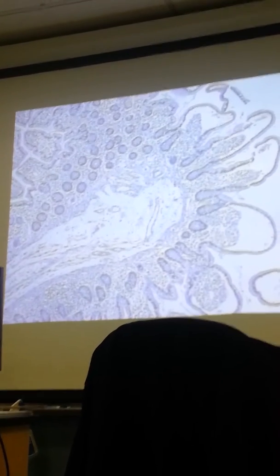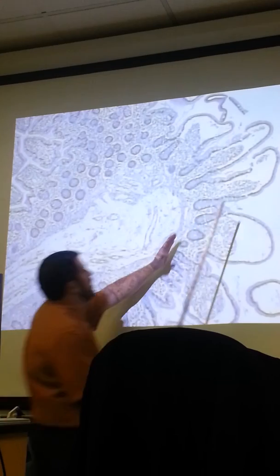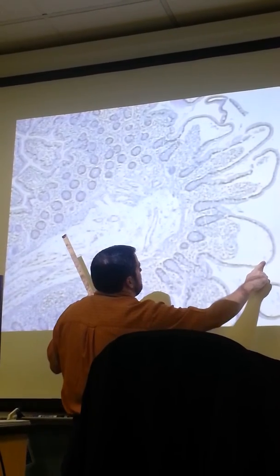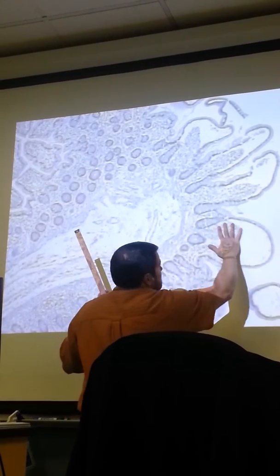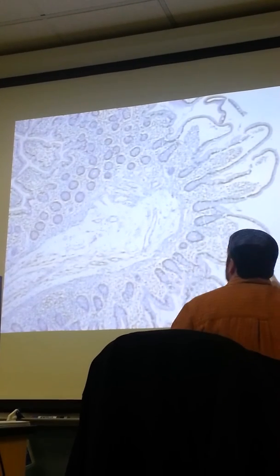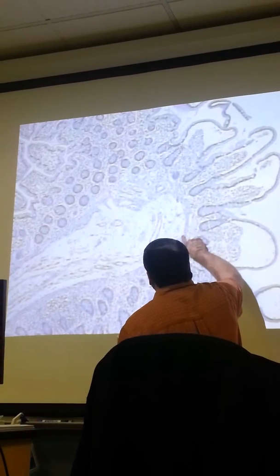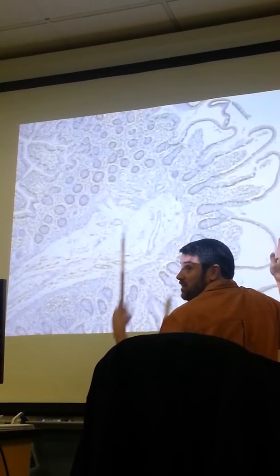Are we good? Because we're panning down. Let's talk about our layers. What is this layer out here? Mucosa consists of epithelium, lamina propria, which we'd have to say is this too. I know the tissue fell out of this, but it was sliced very thin and it just fell out. So this is lamina propria. Then we've got muscularis mucosae, and that's the end of the mucosa because 3 things make it up, right?